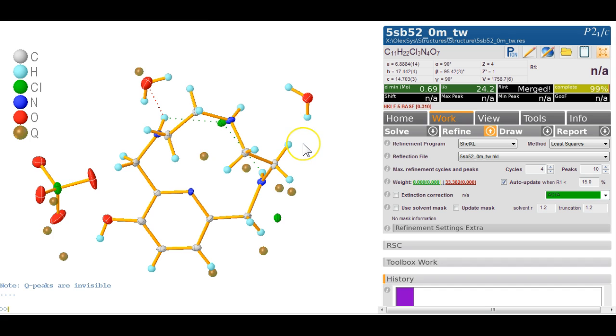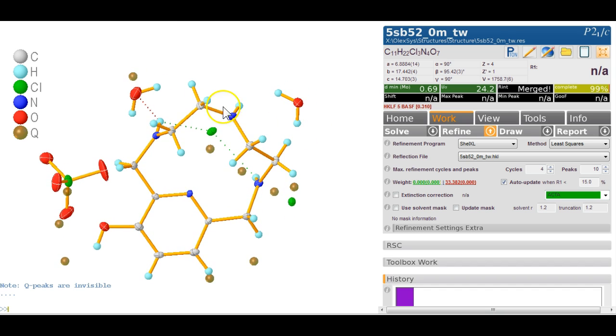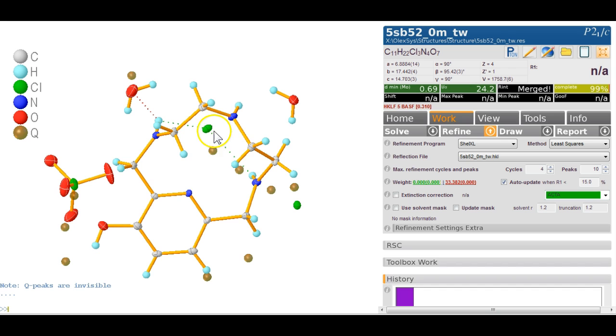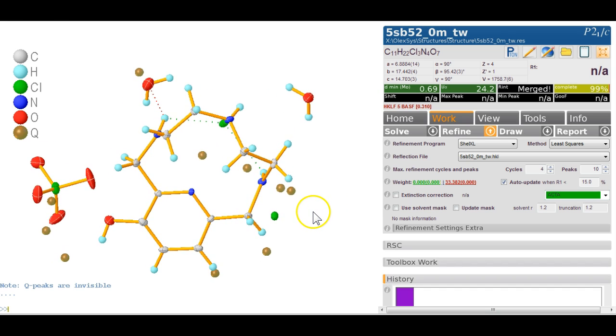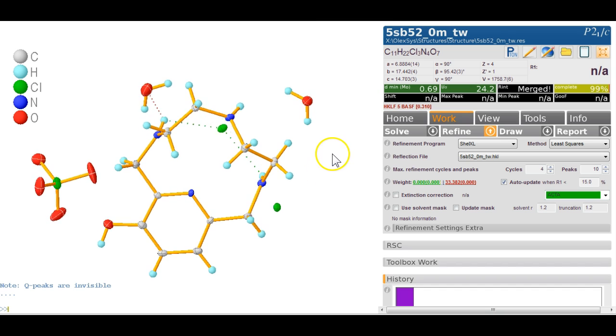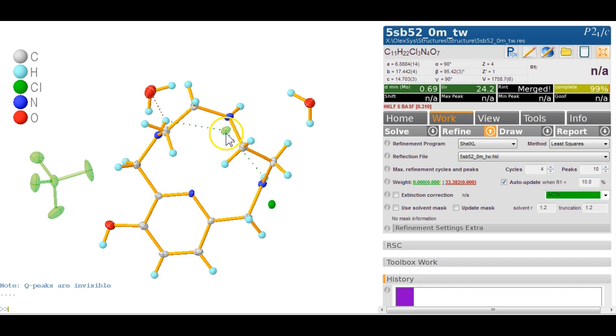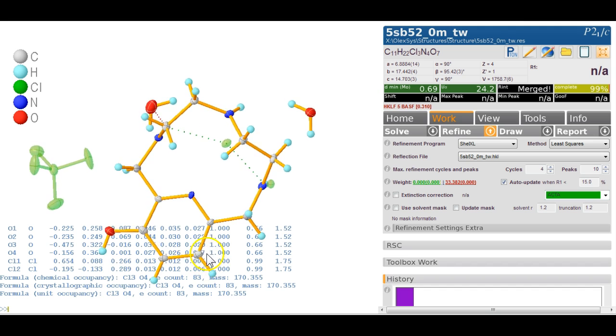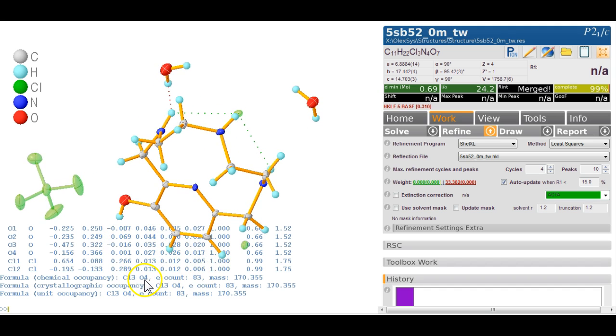So the RES file contains the QPeaks. In this particular case there was a question about charge balance. We've got a molecule here, a perchlorate counter ion, and two chlorides. First let's make sure there's no symmetry playing any tricks. We double click on the perchlorate, on the chlorine and this other chlorine, and type info. That tells us what we selected now is Cl3O4. So we've got one chlorine and four oxygens and then two chlorines here.